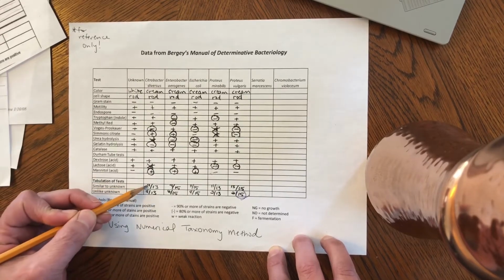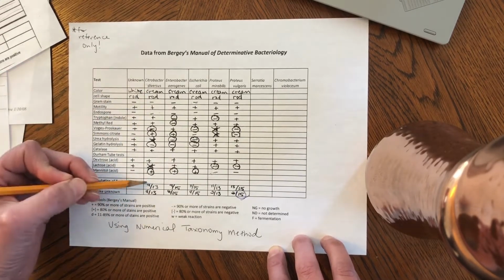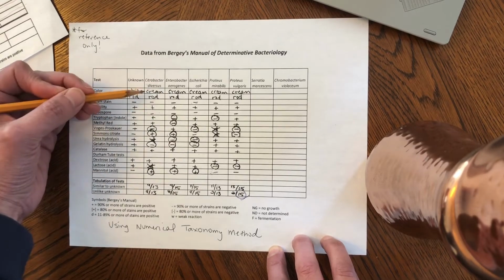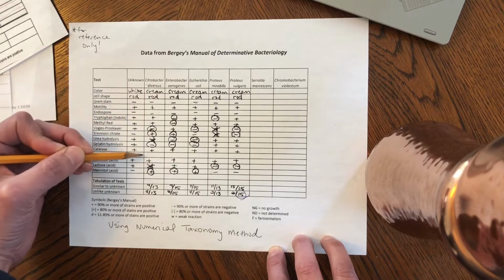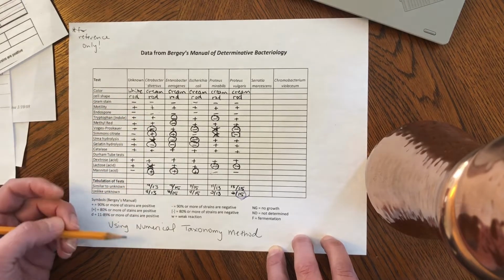And then I get this 9 out of 13 because there's 9 test results that match my unknown. So here's how we're going to get those. 1, 2, 3, 4, 5, 6, 7, 8, 9. That's how we get the 9 out of 13.